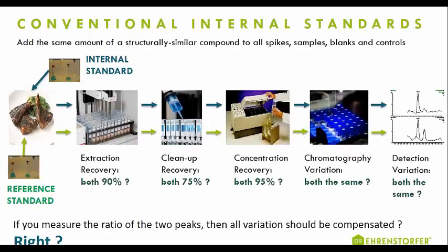So let us start off with what an internal standard is, in their conventional sense. Analytical methods for trace organic residues vary enormously, but typically they may involve a number of sequential steps, each one of which has potential for variable losses of the analyte you're looking for. Internal standards can be used to mitigate this variation.